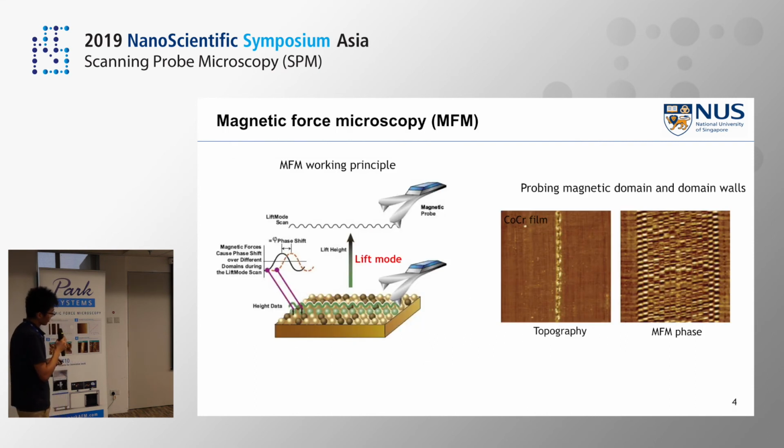So I will talk about the MFM. Here is the simple working principle for the MFM. The MFM is a lift mode in the AFM techniques. In the first scan, the tip will be close to the sample surface and collect the topographic information, and then the tip will lift up.